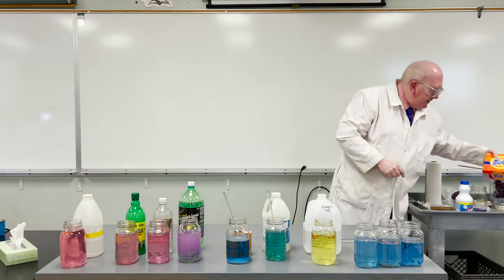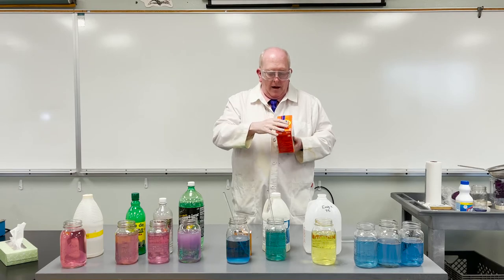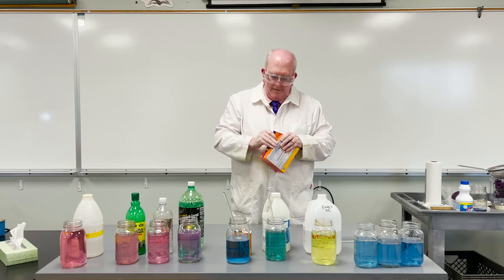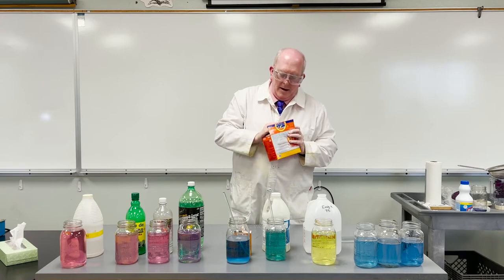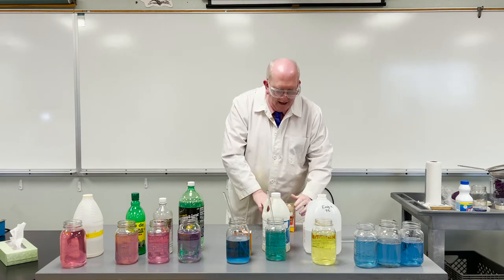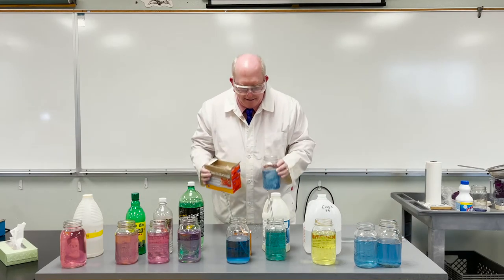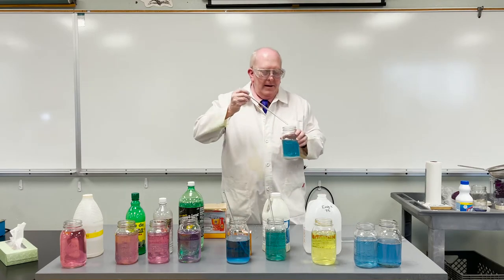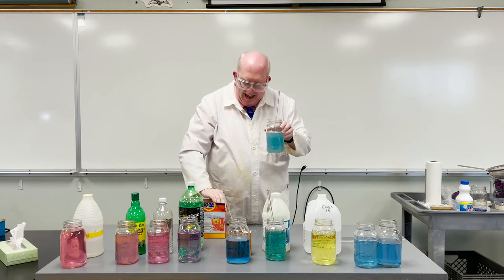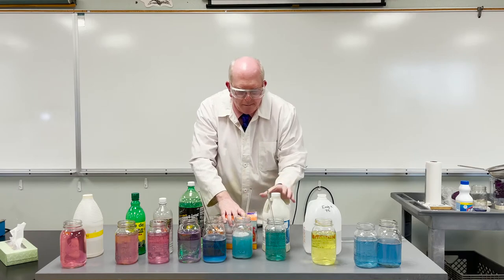I've got another cleaning product here you might be familiar with — this is Tide, laundry detergent. I'm going to figure out how to open this box — should have tested that out before we did the video. It's nice though that you see we actually haven't altered any of these things before we used them. I'm just going to pour some in like that; it'll probably suds up nicely. Now it's basic, but it's not as basic as the NaOH or the ammonia. So this one's probably going to fit in right about here.